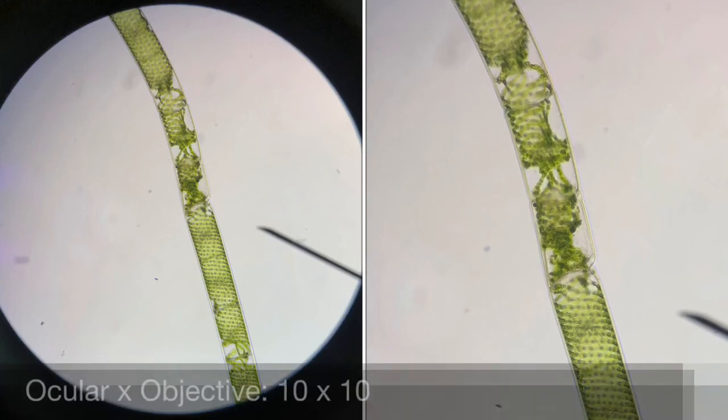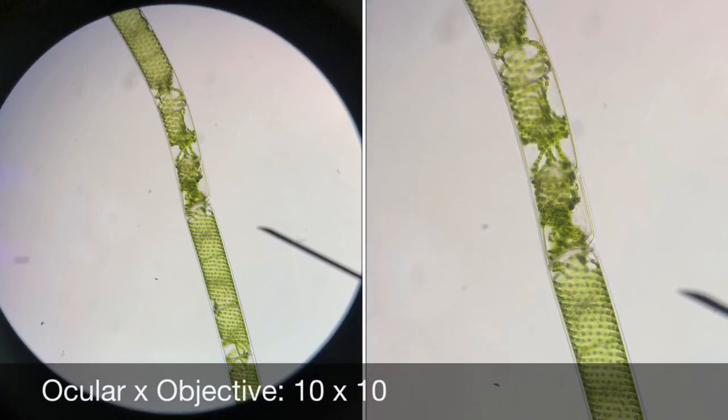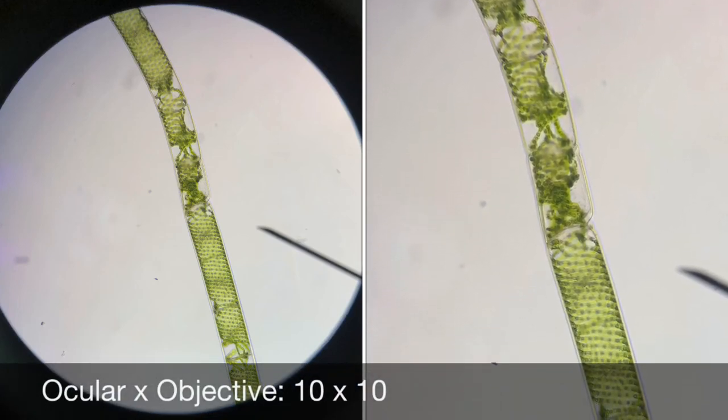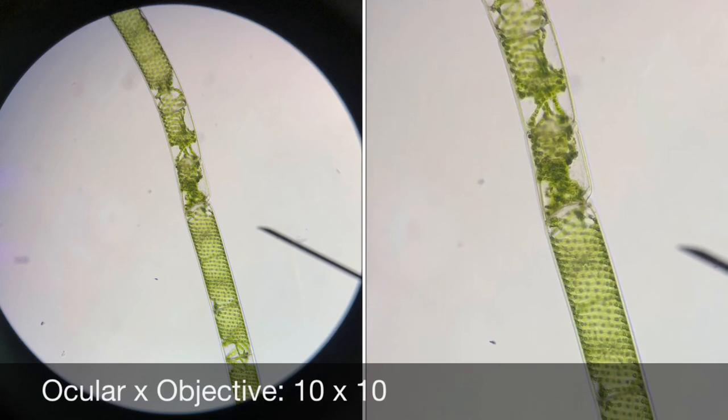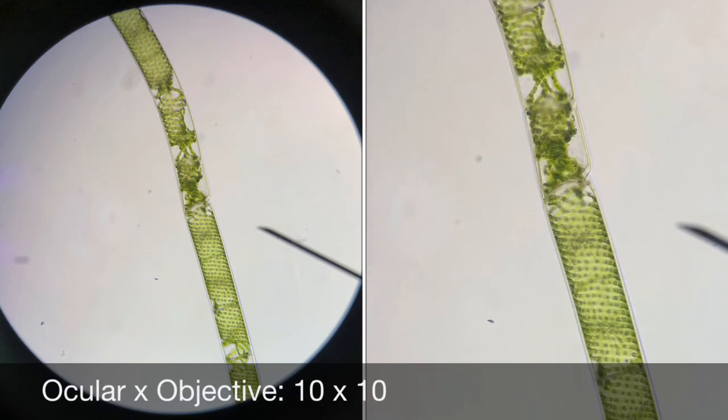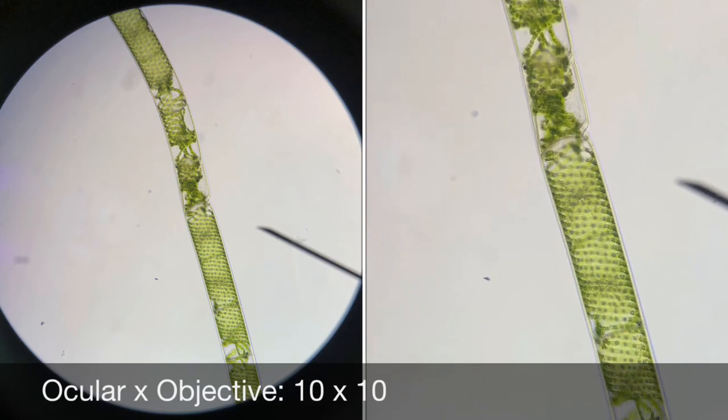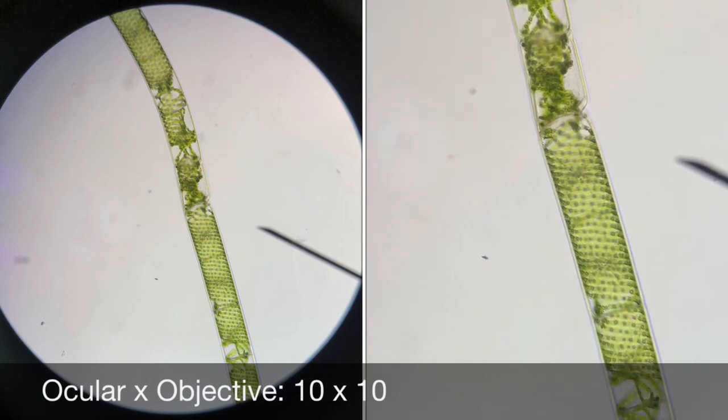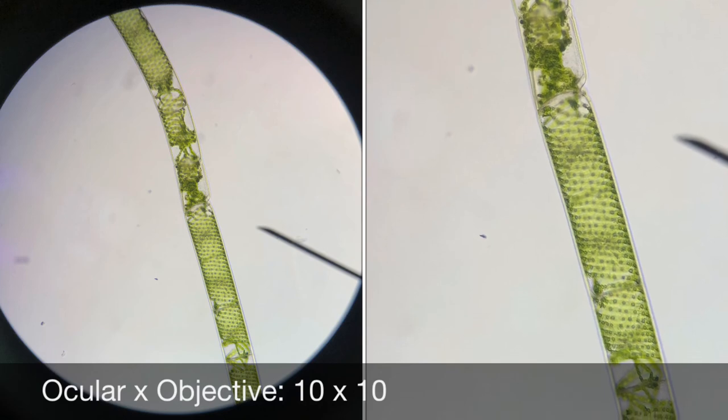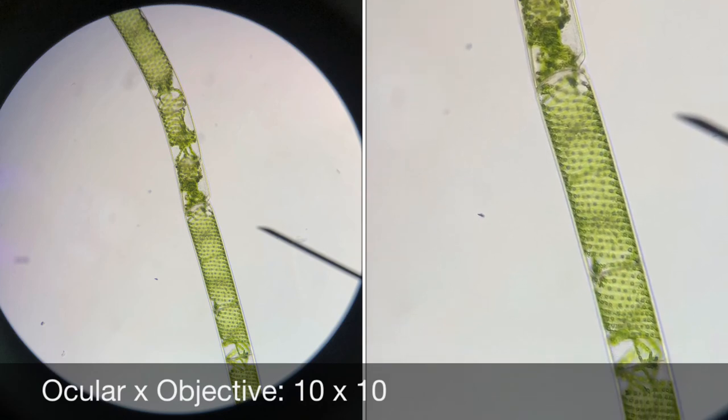Here is the observed specimen under the compound microscope. Draw a picture of the specimen in the lab report. Please write the objective lens magnification and the ocular lens magnification below your drawing.